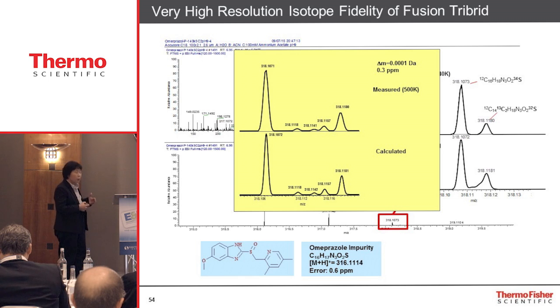So that's why we say a high-resolution mass spec gives you all those benefits. Horizontally, you see what kind of elements are present in your unknown, and then vertically, by their relative abundance, you can calculate how many there are, right? So that's why we say you can do atom counting, right?